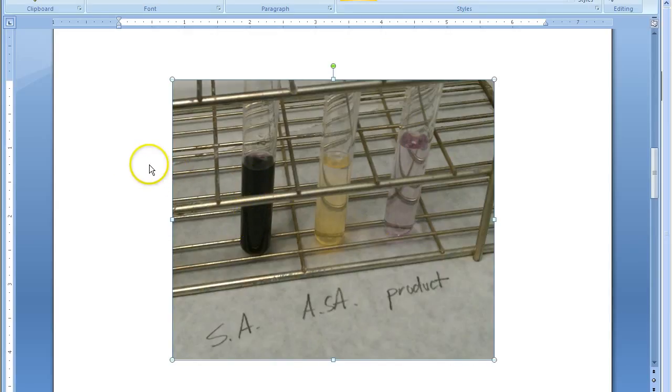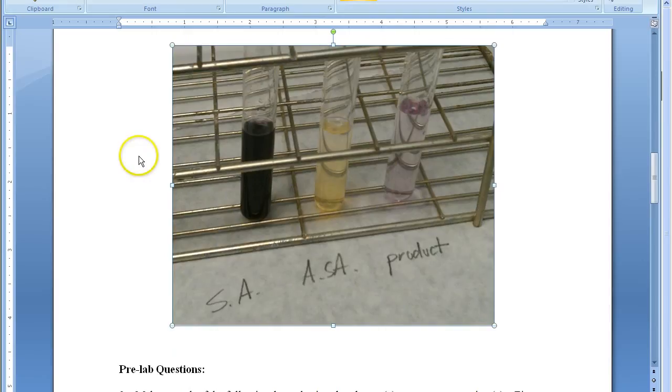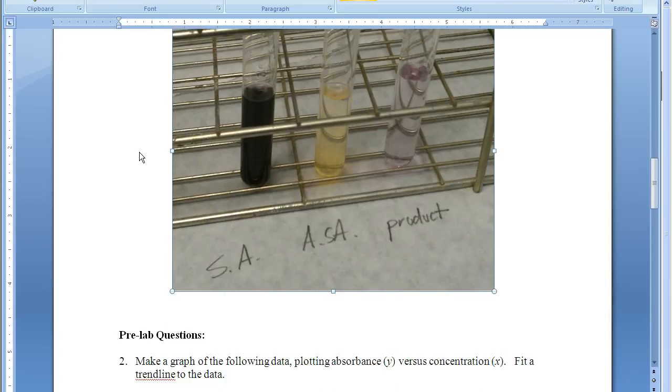So you'll prepare a series of salicylic acid standards. You'll start with a very strong concentrated version like this deep purple one, and then you'll dilute it down and record the absorbance of each of those known concentrations. This is very similar to what would have been done in the iron content experiment.